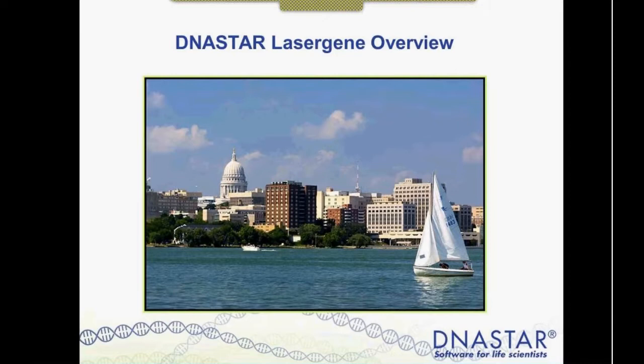Okay, so today we'll do a general overview of the DNASTAR Lasergene Suite, and in particular the Genomics Suite, and I'd like to introduce four different workflows. We'll start with some slides to introduce those workflows, and then I'll go into the setup, the assembly of the data, and some of the downstream analysis.